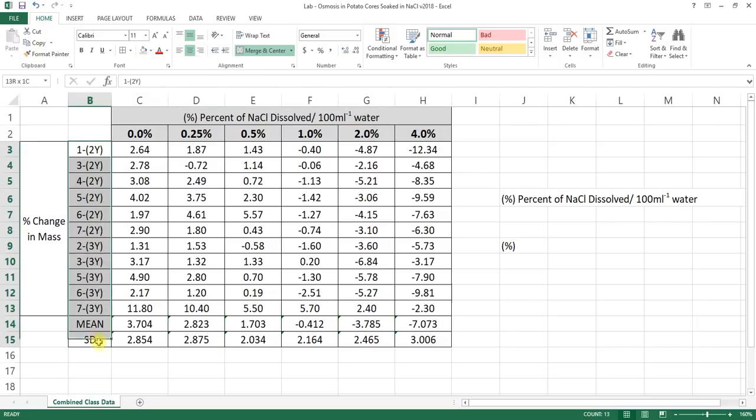And let's just do this section by itself and give it a gray shade, and then we'll do this over here too. Now, why do I do that? Because this way the titles stand out. The independent variable is this, and then we have all our trials of the dependent variable. And there we go. That's really all there is to it. So if we look at our data like this, it is a pretty standard lab.